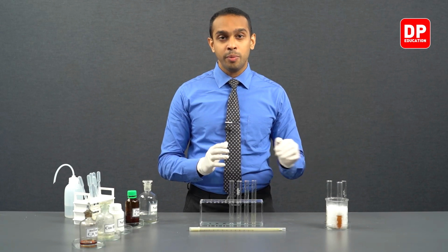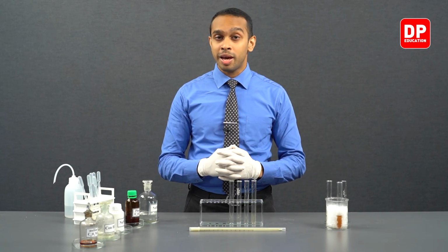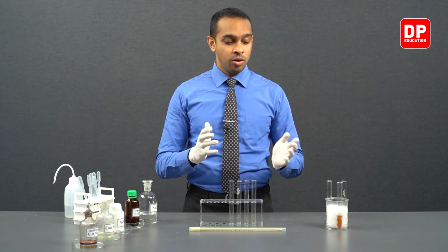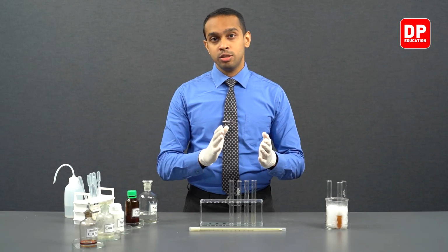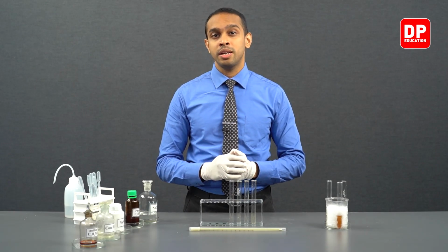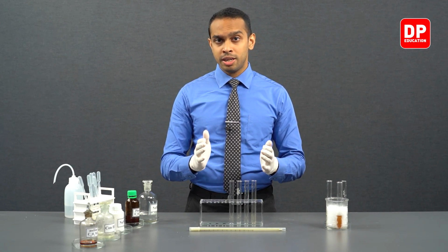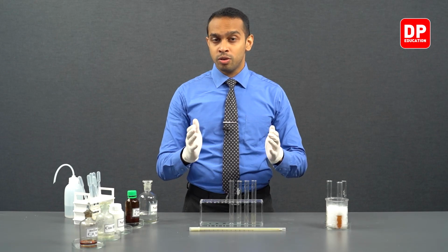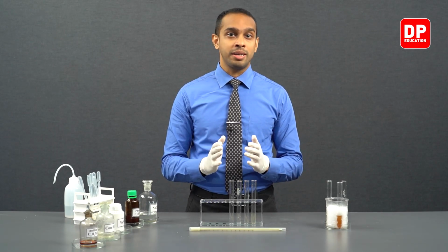While the samples in our test tubes cool down, let's talk about the reaction that is taking place over here. So we have aniline dissolved in hydrochloric acid, and to that sample we are going to add sodium nitrite. Sodium nitrite in the presence of aniline and HCl will produce benzene diazonium chloride.